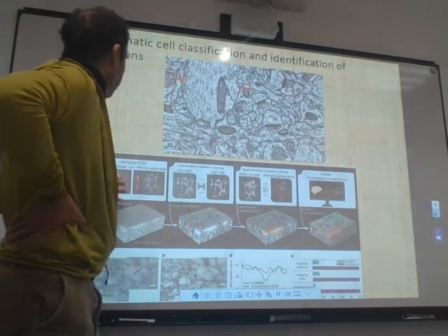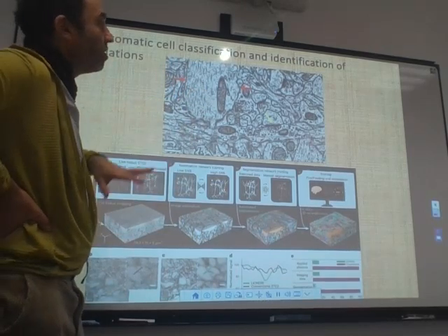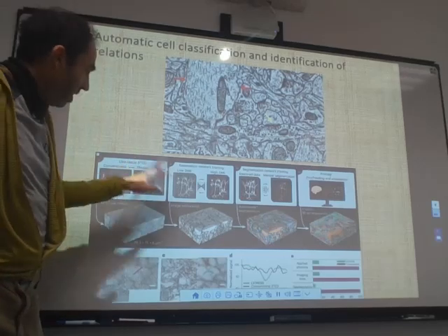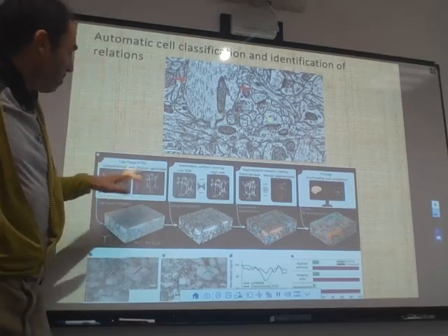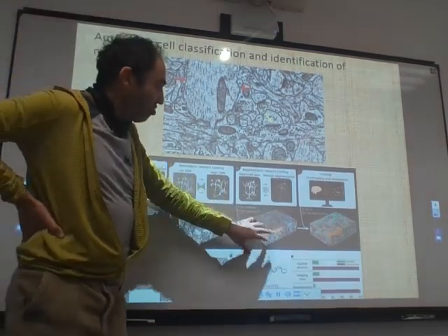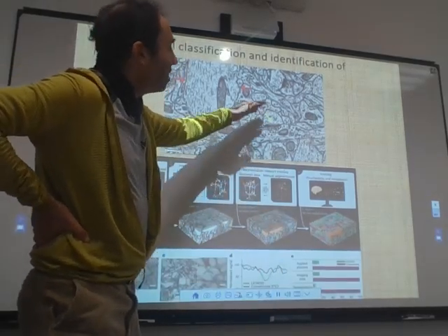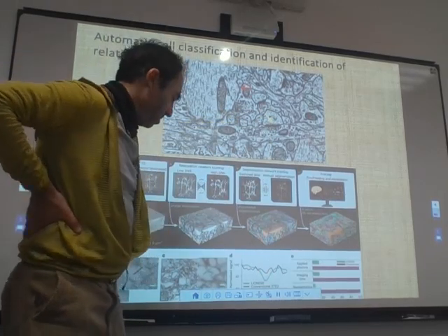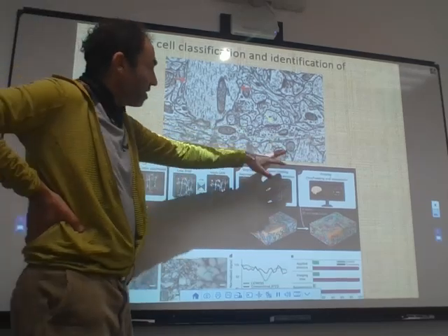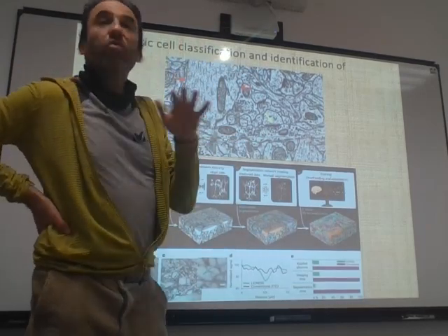Okay? So they developed some kind of approach for not necessarily frozen images. This is called live tissue using STED. STED is a specific type of microscopy, and they have started to look at this neuropil in 3D, look at the structure that they can get. There is no quantification, there is no machine learning to recognize things, but it means that they have moved the technology to tissue, not frozen tissue.